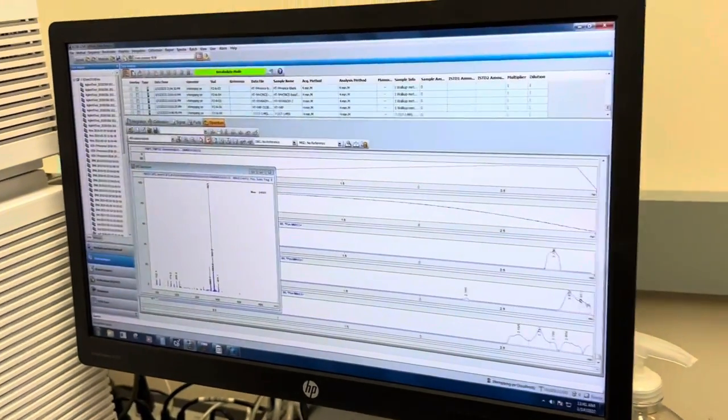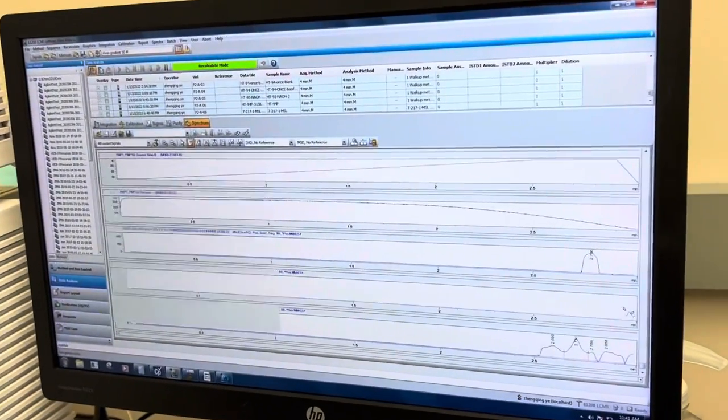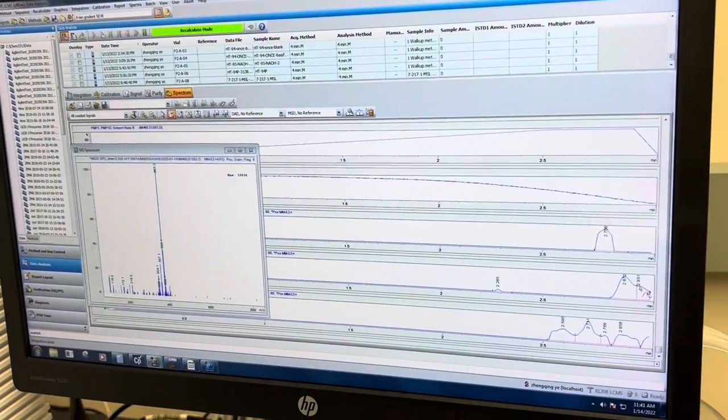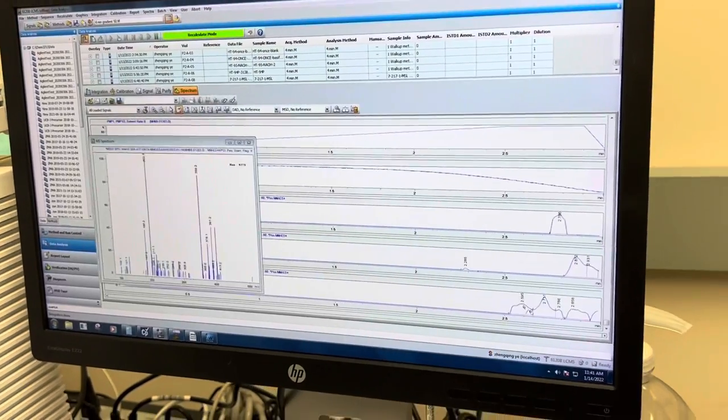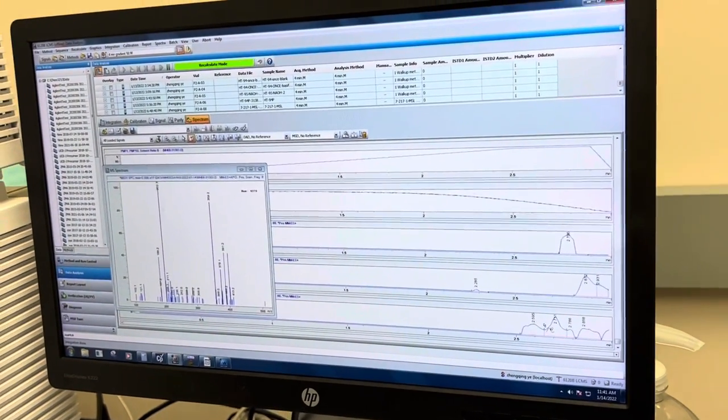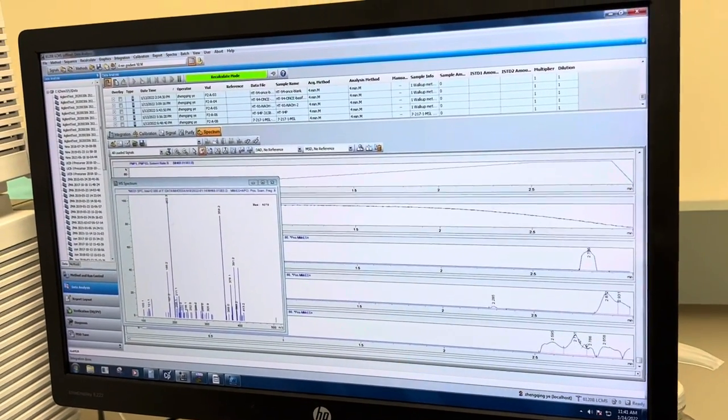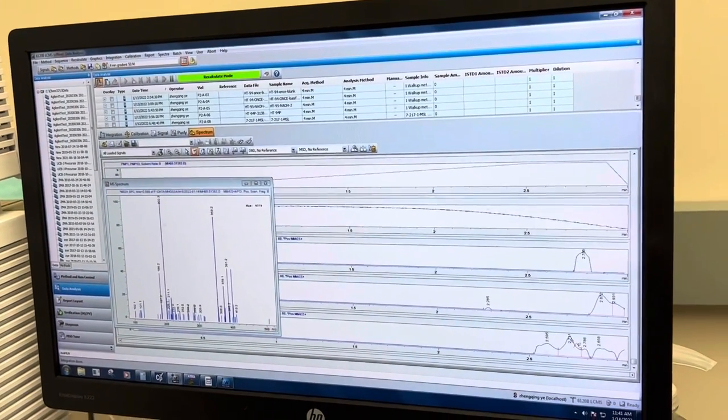383. So we have to find out what is 383. 383.